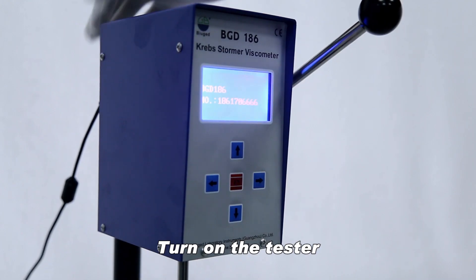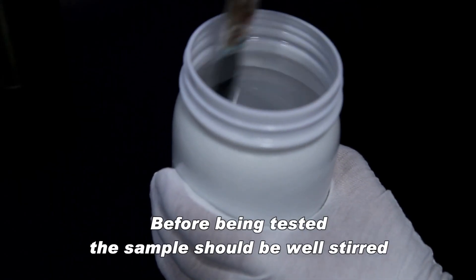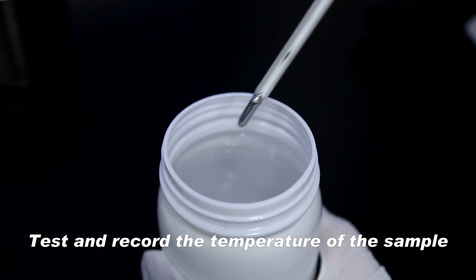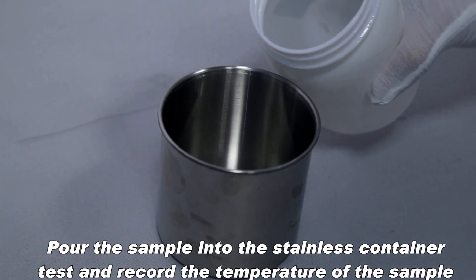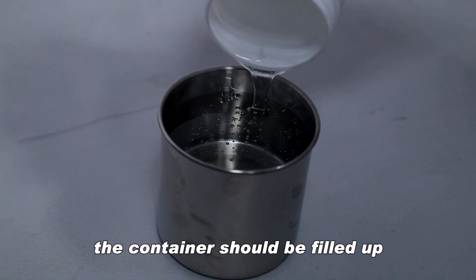Turn on the tester. Before being tested, the sample should be well stirred. Test and record the temperature of the sample. Pour the sample into the stainless container, test and record the temperature of the sample — the container should be filled up.